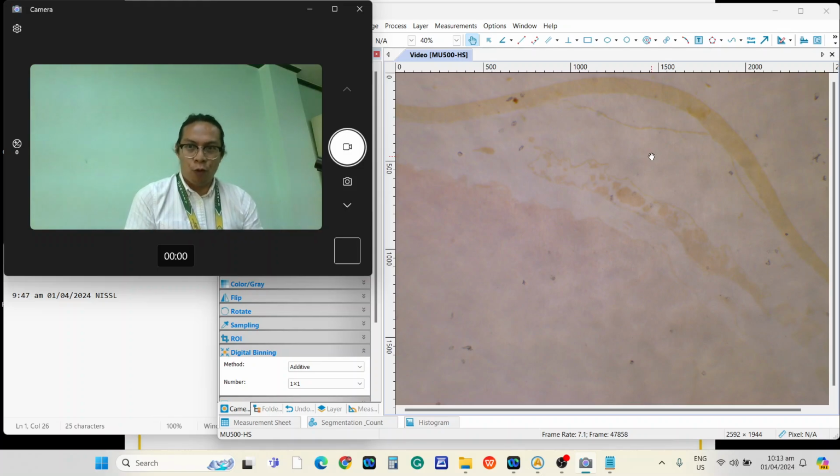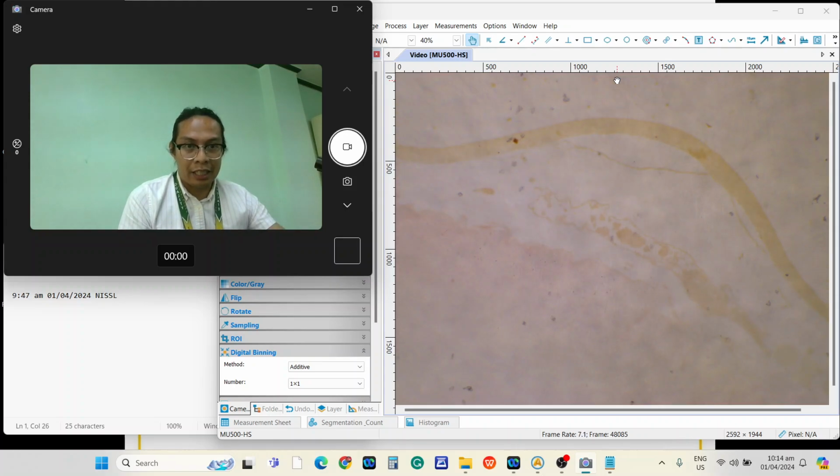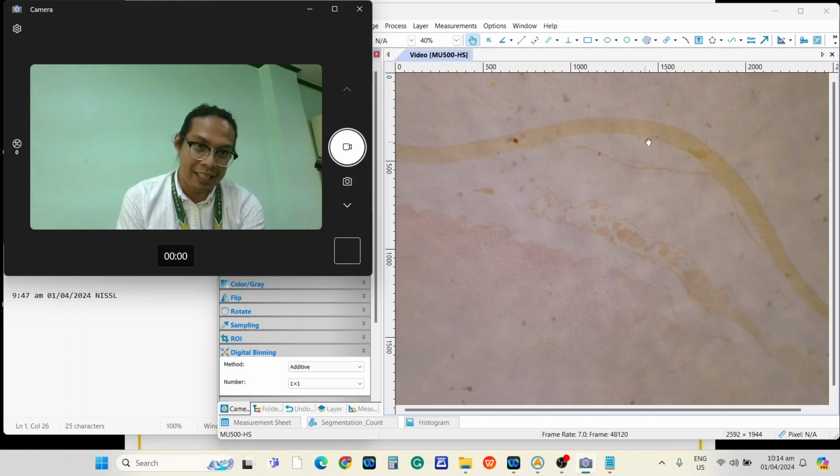Okay, the meninges is of course made of three structures, the dura mater, the arachnoid, and the pia mater. Yung mataba, yung malapad, this one, that is also known as the pachymeninx or the dura mater. It is fibrous in nature. It is continuous with the periosteum of the bone. There are only certain spaces kung saan nakahiwalay si dura mater sa bone. Okay? So, in this section, appreciate natin na nakahiwalay yung dura mater sa bone. So, natira yan. That is the dura mater.